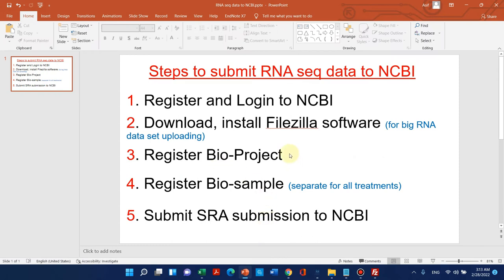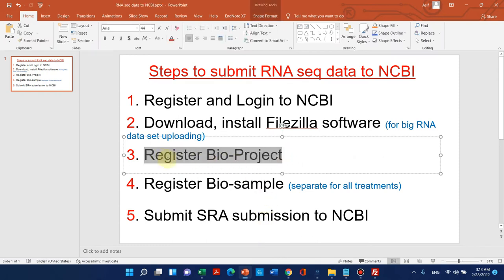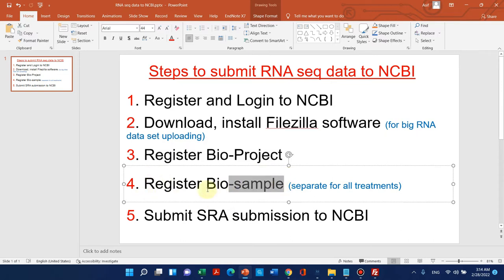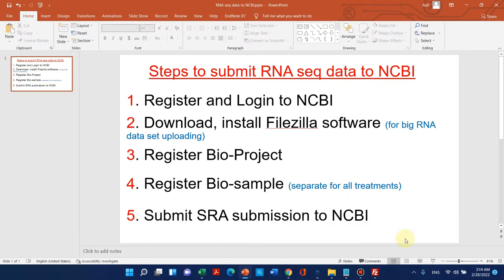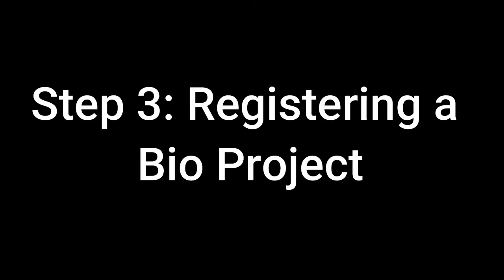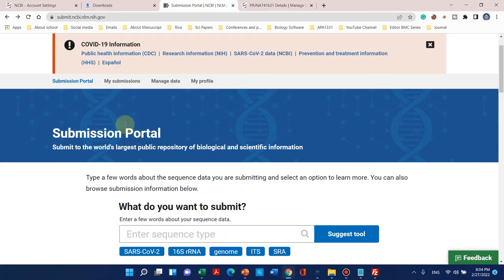The third step is the registration of a BioProject, and the fourth step is the registration of BioSamples. In this case we will use six BioSamples, and at the last stage we will submit the SRA submission to NCBI and get an accession number. Now let's move to the third step: registration of our BioProject.